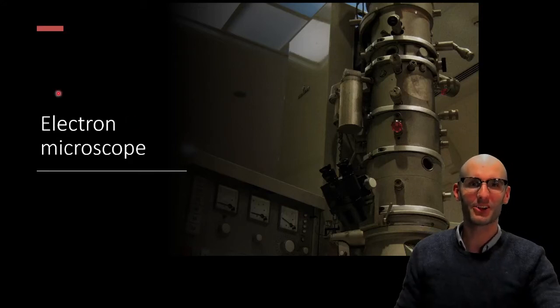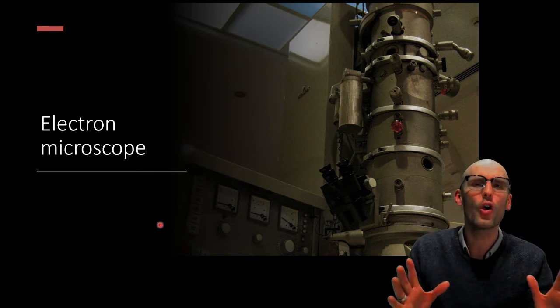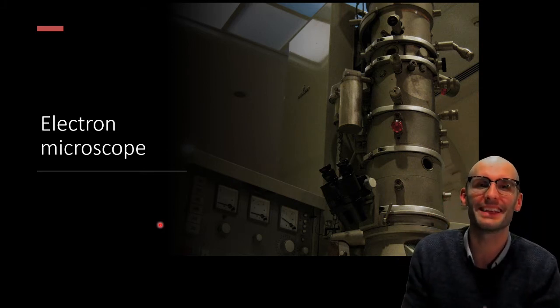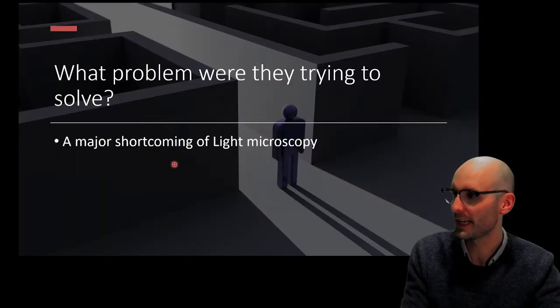Hey team, Dr. Jack Order here, and in this video I'm going to be taking you through the electron microscope. I've been showing you so many beautiful electron microscope images throughout my videos. I felt it was so important that you understand how it works, why we use it, and what its benefits are. So let's jump into it here.